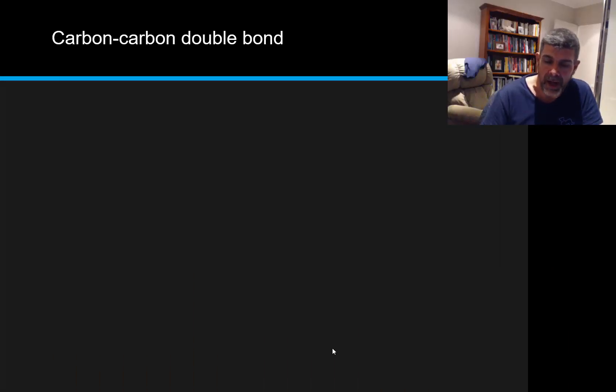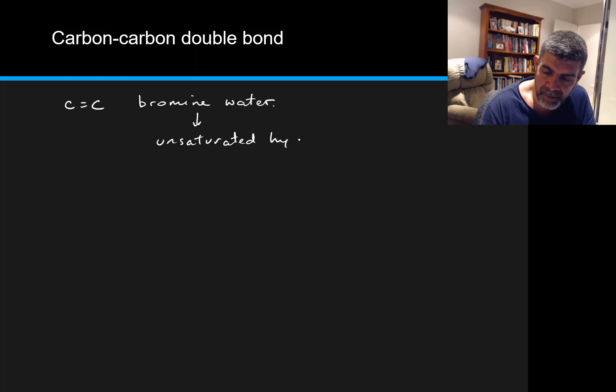So I hope that what you've been thinking as you've looked at the beginning of this video is, well, the carbon-carbon double bond can actually be identified very easily with the addition of bromine water. Bromine water is a great test substance for unsaturated hydrocarbons.